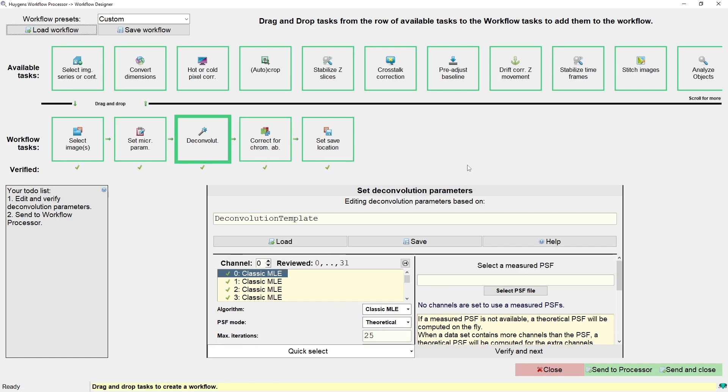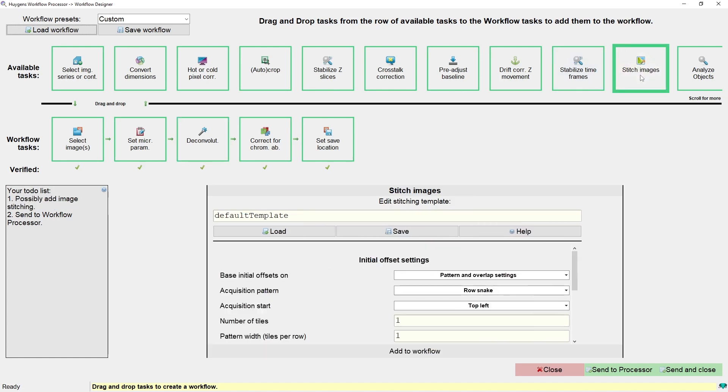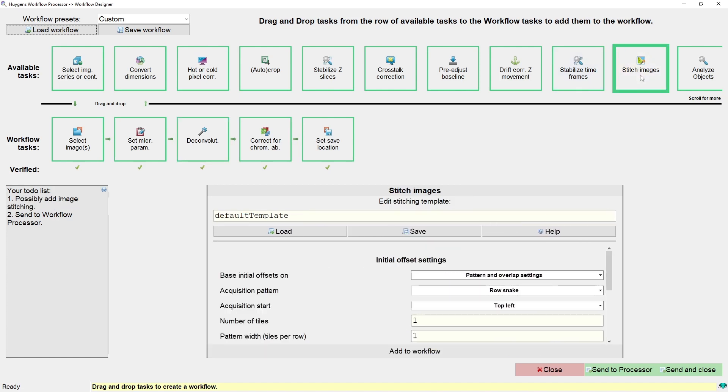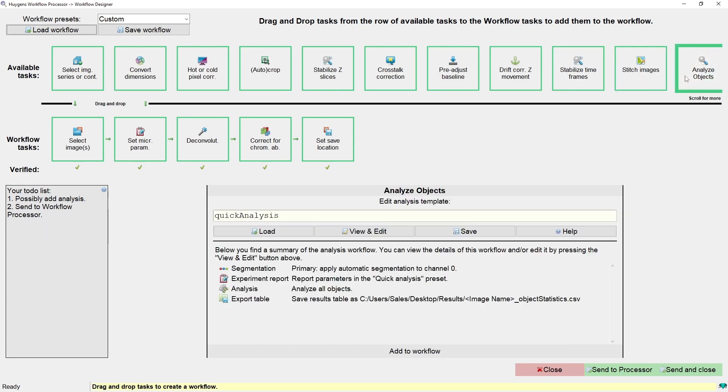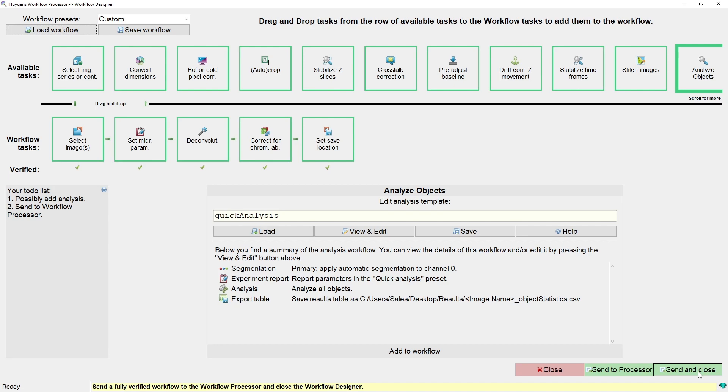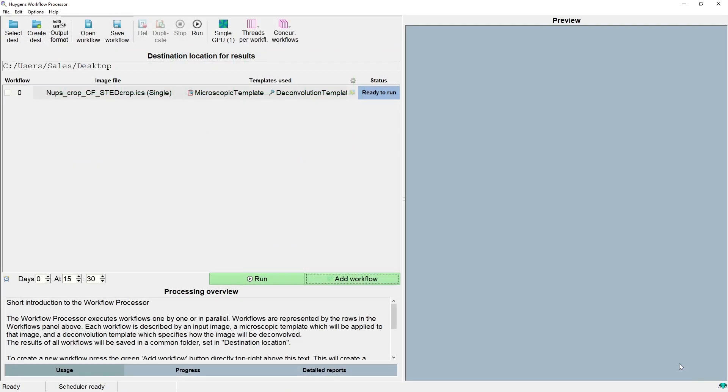Another new feature is the stitch task for the workflow processor. You can now stitch in batch and the analyze objects task. That will now send the task I have created to the workflow processor by clicking send and close. And we now see the workflow processor window with this new task ready to run.